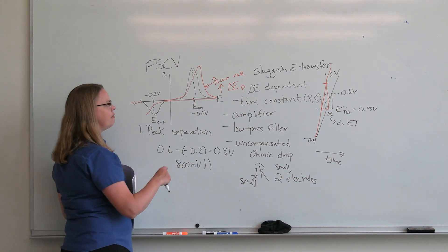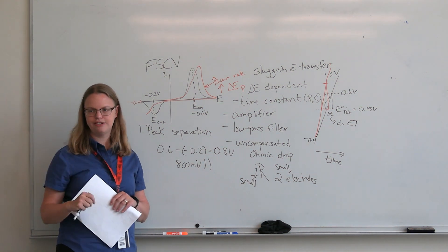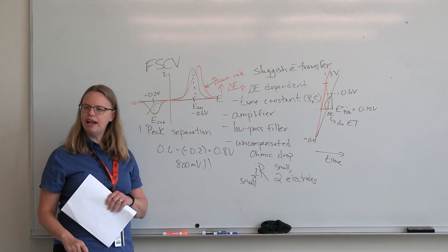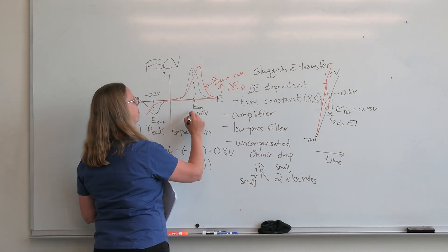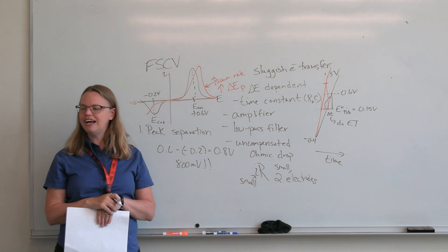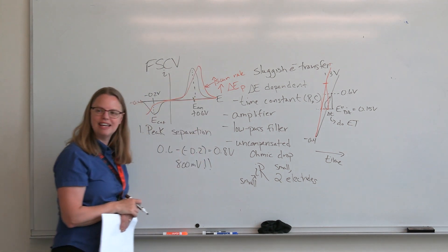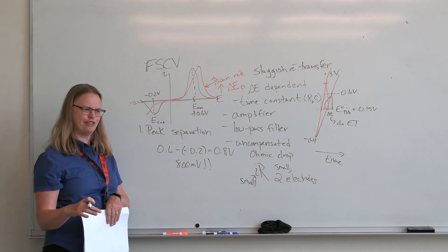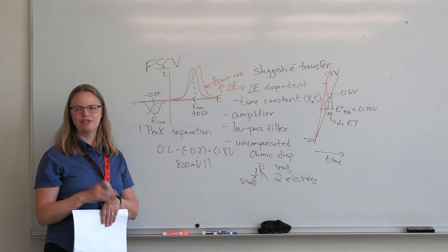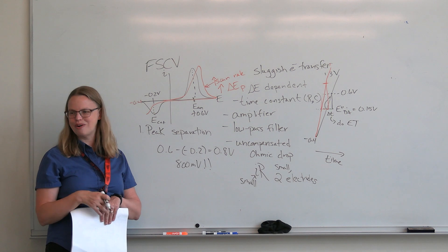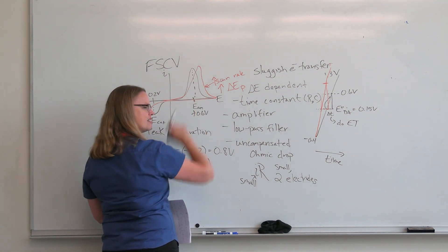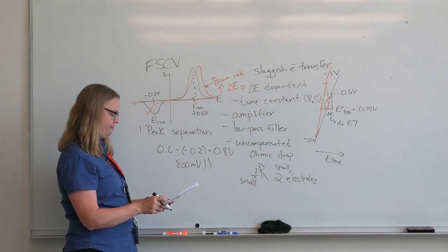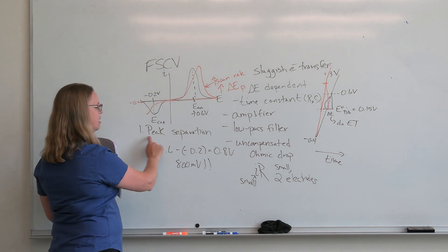If you think about amperometry — where they just hold at a constant potential — most amperometry experiments for dopamine at single cells have been done at 0.6V. They picked 0.6V right off the FSCV peak. That's a problematic way to pick your amperometry potential because the peaks are shifted in FSCV. You can hold at 0.2 or 0.3V and see the same amperometry results for dopamine. You should pick your amperometry potential off of slow-scan CV, not fast-scan CV.